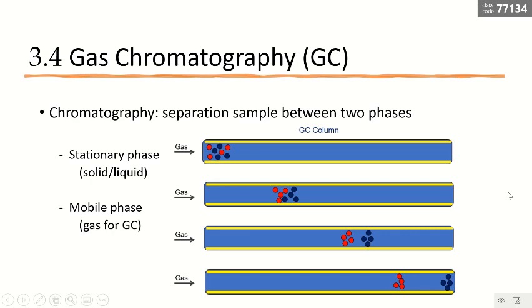Chromatography typically has two phases. One is called the stationary phase, one is called the mobile phase. What does it mean? Imagine the yellow part, they do not move. Basically they are the surface of the tubular structure, which we normally call the column, coating the inner surface. They don't move, by right they should not move. That is what we call the stationary phase.